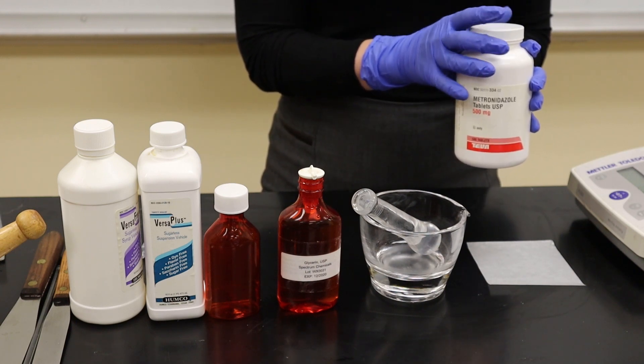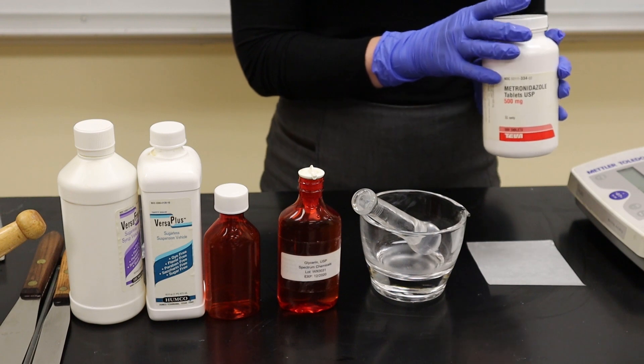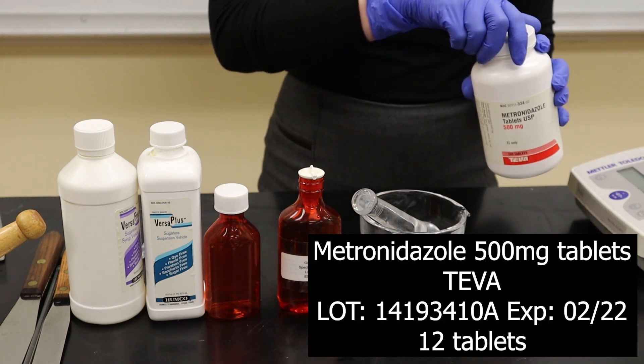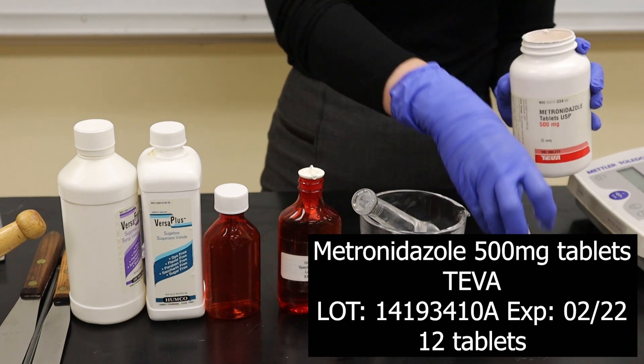Now instead of having metronidazole powder available to us, our source of metronidazole is a 500 mg tablet, and so in order to make this product I need 12 tablets.